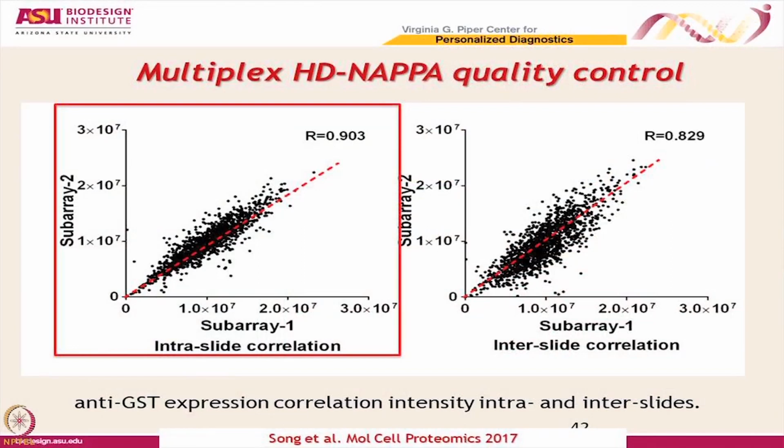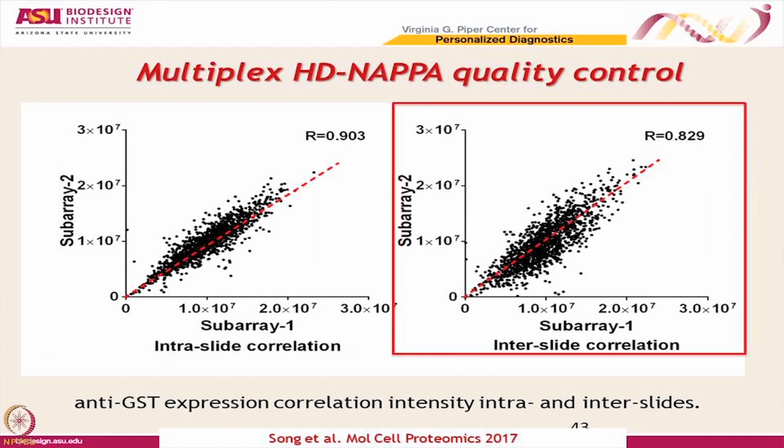What we did here is we compared one of those subarrays to another subarray to make sure that from subarray to subarray they were reproducible. That's what this is. This is within a slide, and then this is looking at 2 different slides. Again, to make sure everything is aligned right.